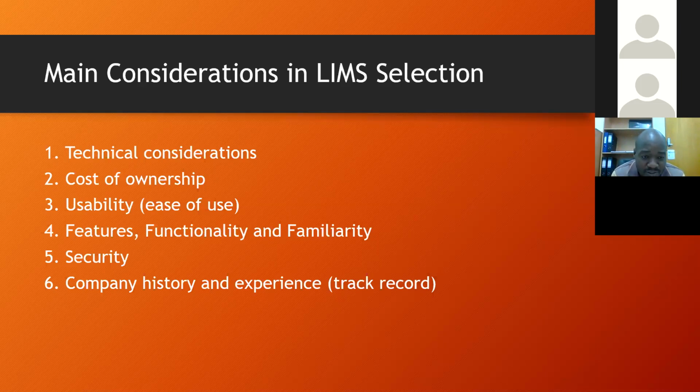And then you also need to look at the features, functionality, and familiarity. Based on your environment, and by environment I'm referring to country differences, country policies and country regulations, there are features and functionalities that are regulated within a particular country.